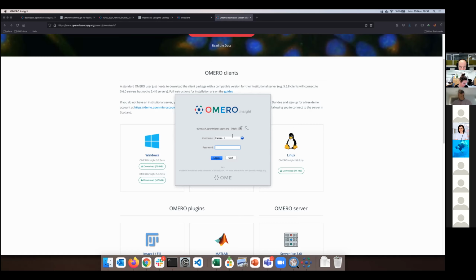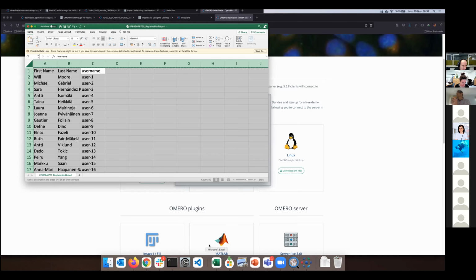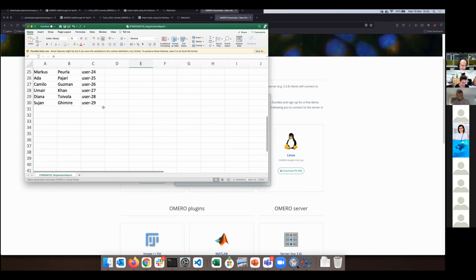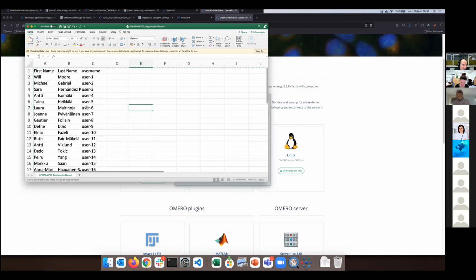So now it comes to this email, which you probably received very recently from Joanna. Joanna was so kind and sent an email to each of you where there is a list with your usernames, which looks something like this. Now I need you. There is not anything really informative in that list except that number.